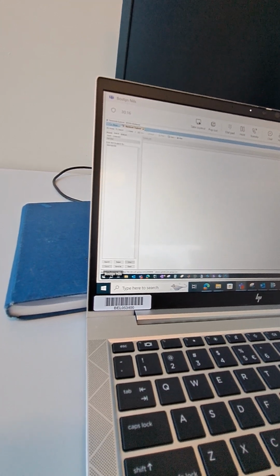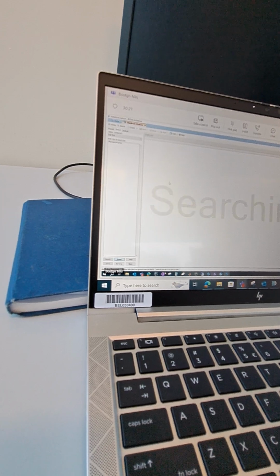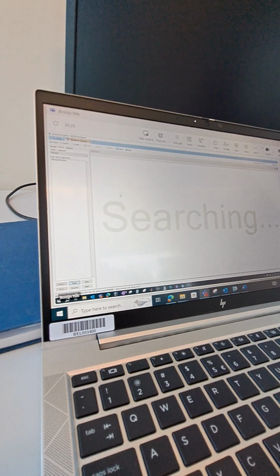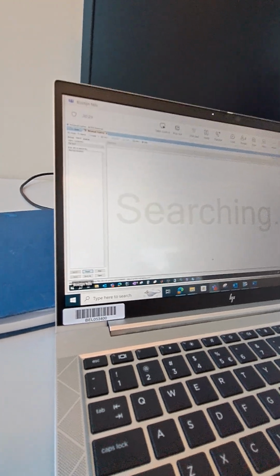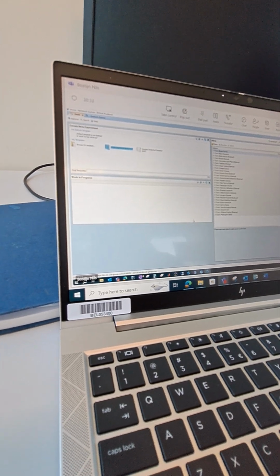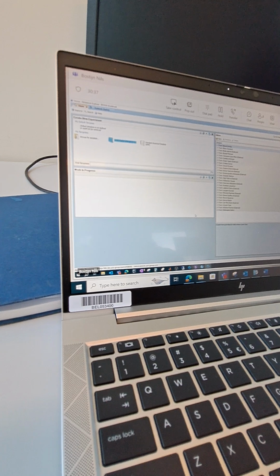Disproportionation. You can also search it, but I don't know if you will find a lot, but you can have a look. So that's a bit the ELN.